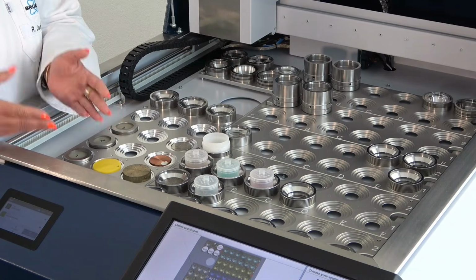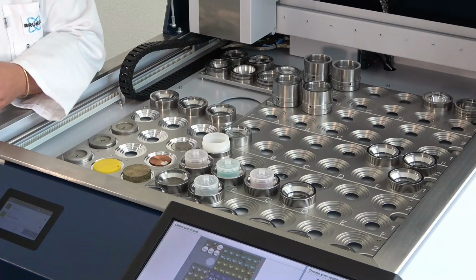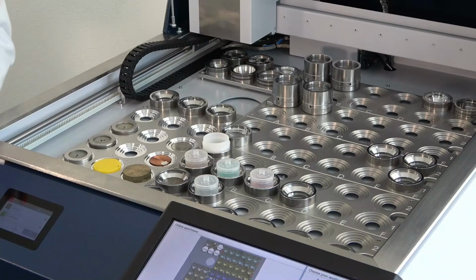What is also important if we talk about methods? When we analyze materials like already shown before, sludge, slurries, maybe some more inhomogeneous samples, inhomogeneous powders, this means the sample itself is already having a little bit higher errors due to sample preparation.